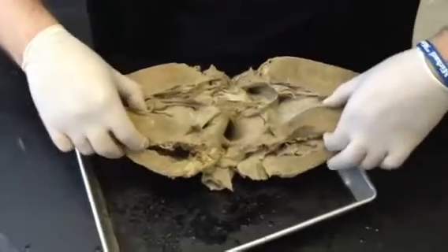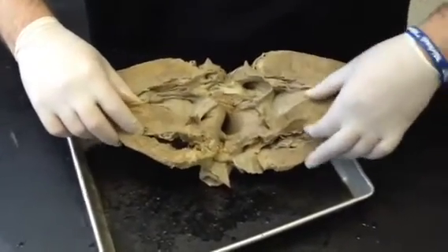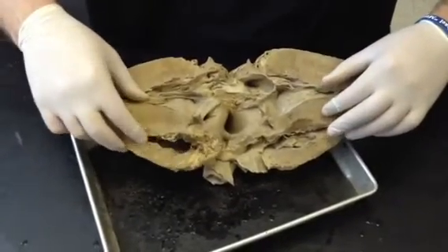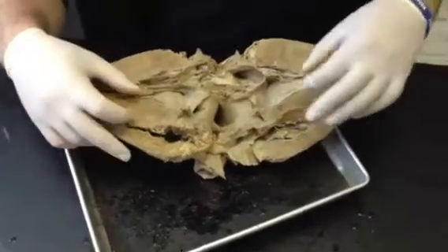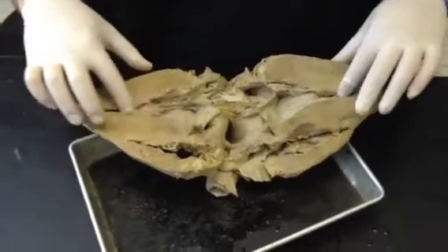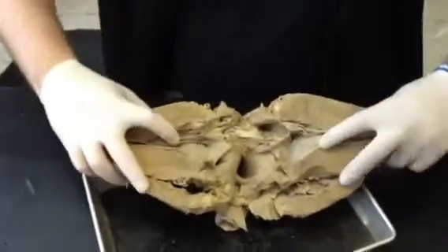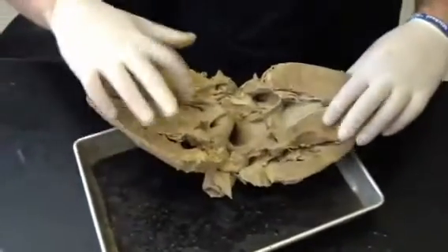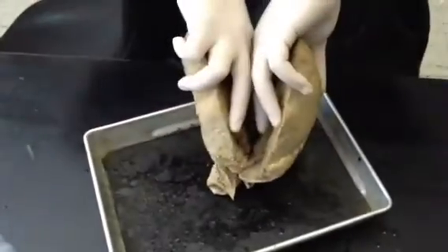And then this chunk of myocardium here that separates the ventricles is called the interventricular septum. That's right. The one that mirrors the groove on the outside? Yes. Then you can see here, this is the left ventricle. I know that it's the left. Oh, and another thing you have to realize, this is one cavity. So this isn't left and right. This is one cavity. This is the left ventricle. We've just cut it.